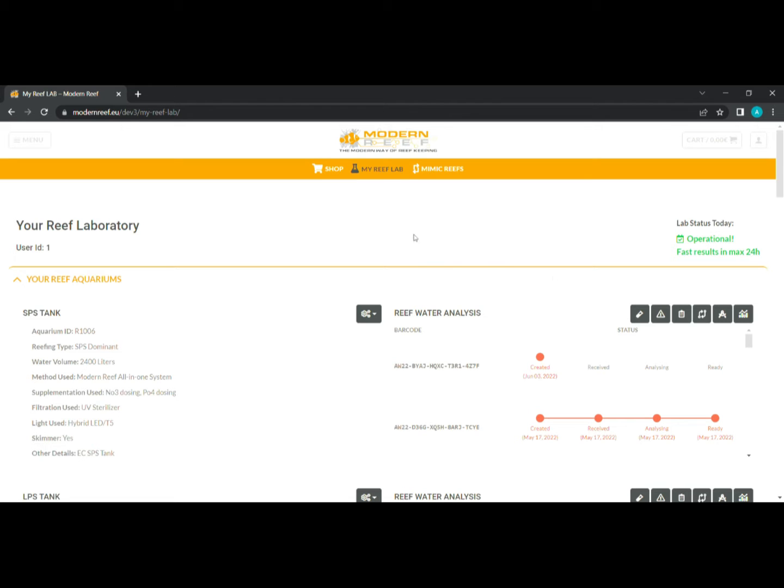Now presenting the interface. I will recap a bit and try to be as fast as I can. I know that this video maybe will be long, so let's get started with this.